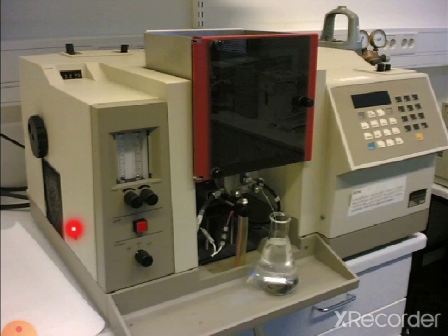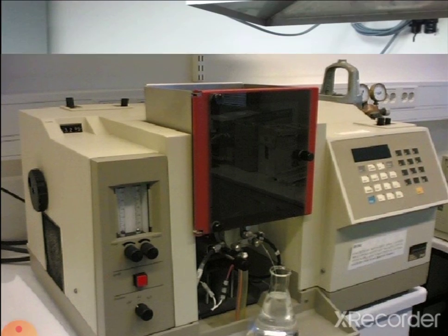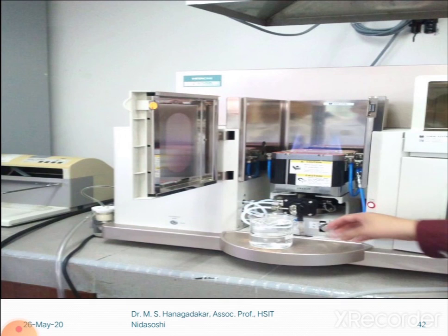So this is the atomic absorption spectrophotometer instrument. What you can notice is that here you can supply the sample solution. This is the nebulizer system. In this portion you have the hollow cathode lamp, where you supply the light onto the sample. Here you have the flame source, and here you have the display system, where you can note the readings. The same thing is what I have shown.